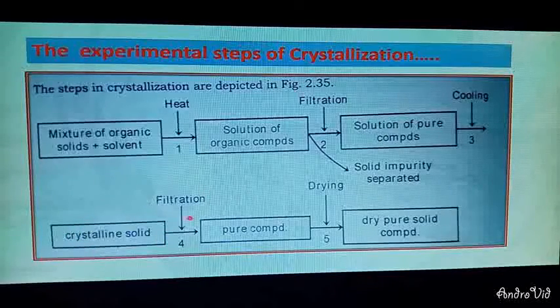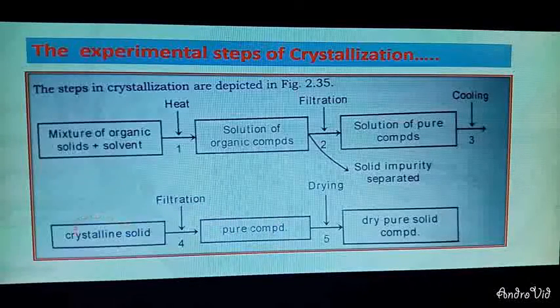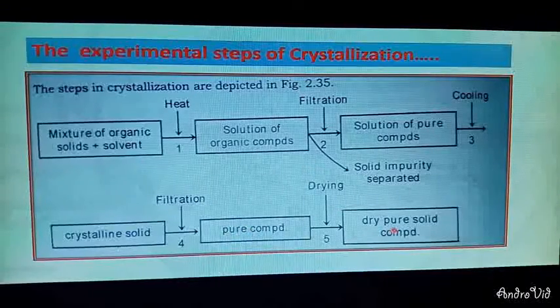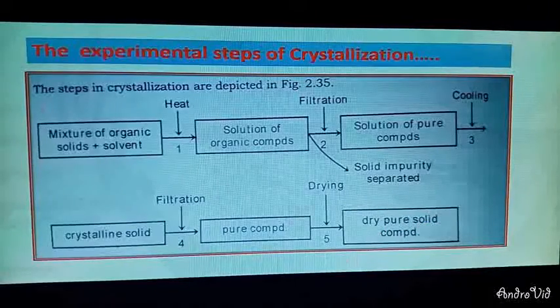After filtration, the mother liquor solution will be passed through the filter paper, and pure crystalline solid will be on the filter paper. Now only drying is the process, to make sure of the drying of pure compound, and by this way you will have dry pure solid compound.